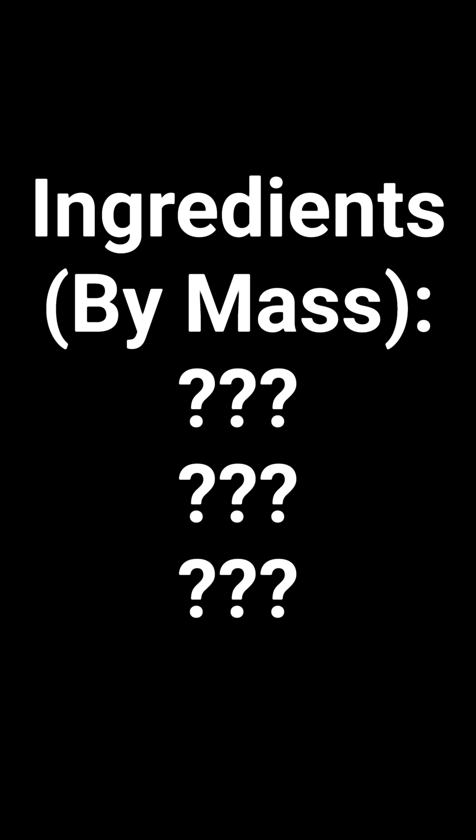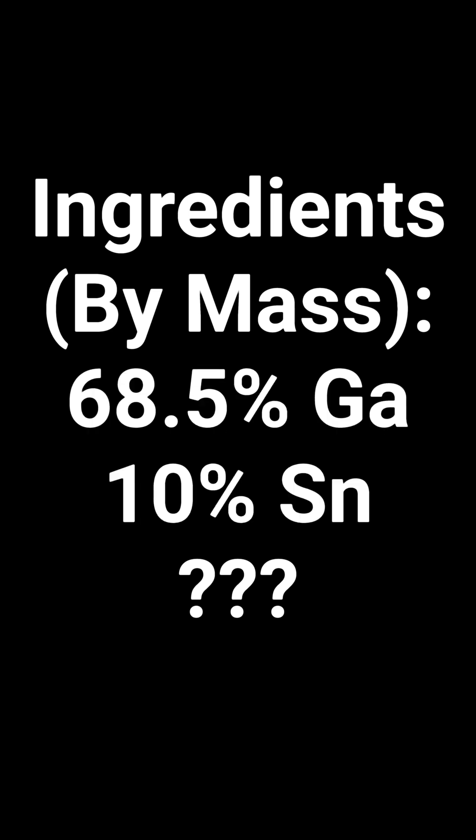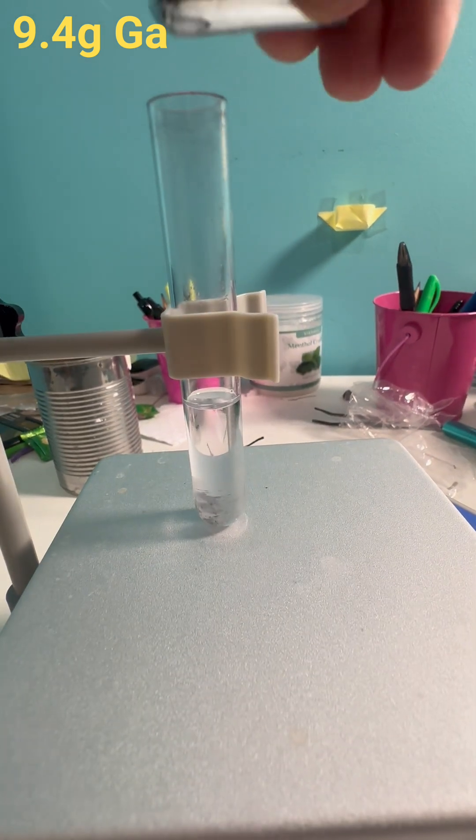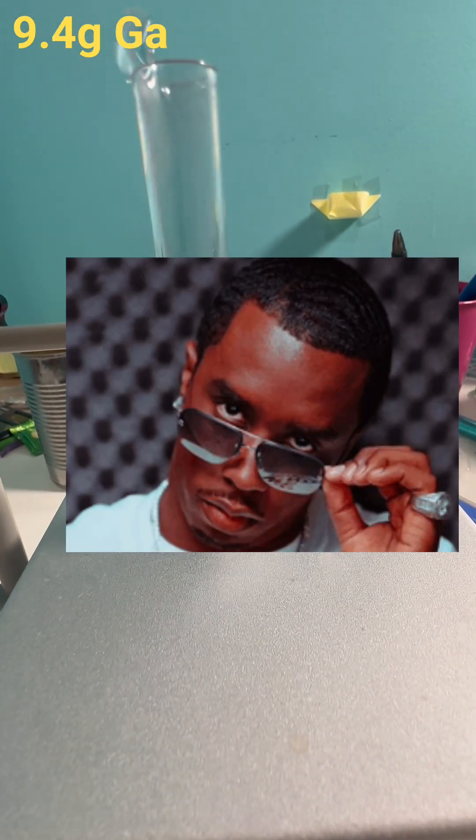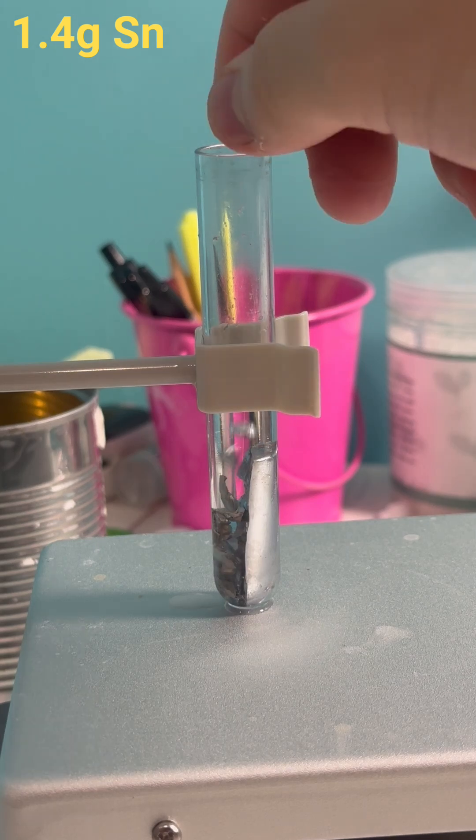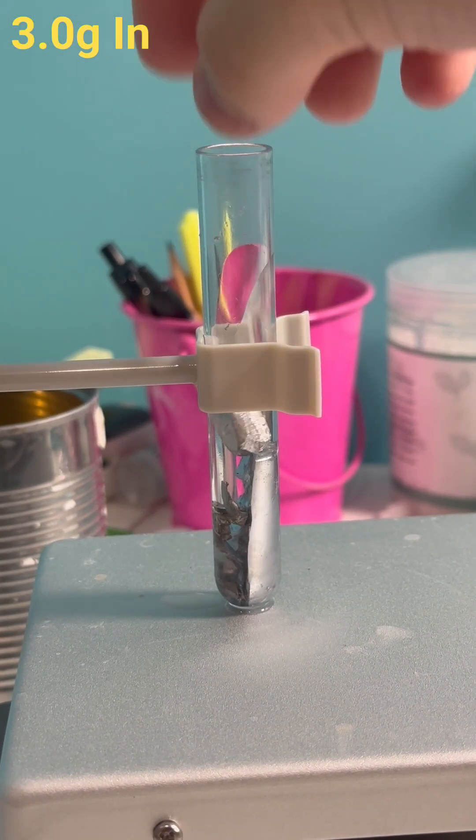In order to make this alloy, we need three ingredients: gallium, tin, and indium. First, I add around 9.4 grams of gallium to a test tube filled with baby, I mean mineral oil. Then, I add 1.4 grams of tin. Finally, I add 3 grams of indium.